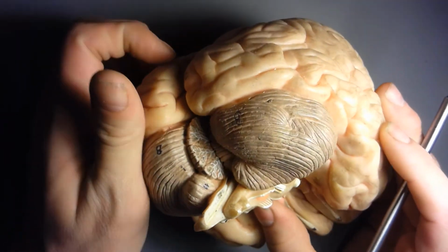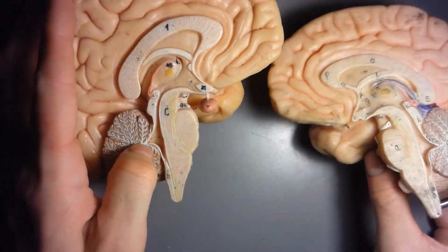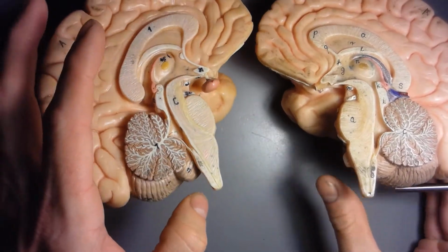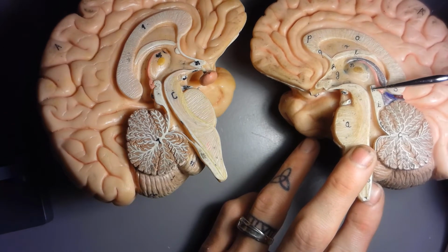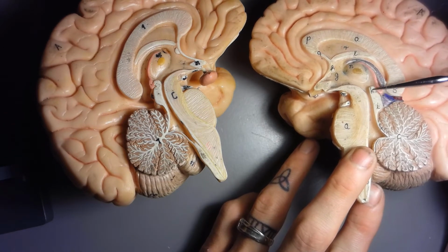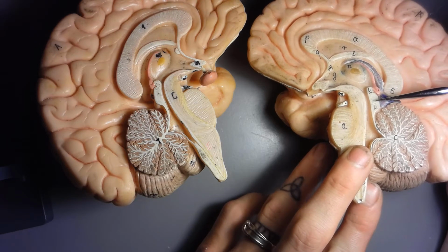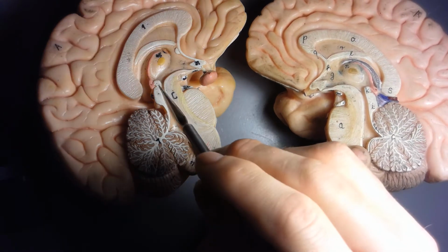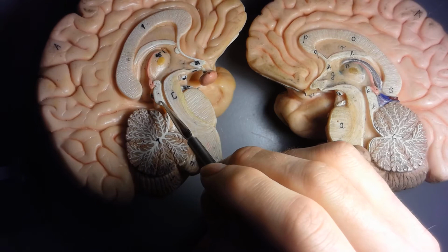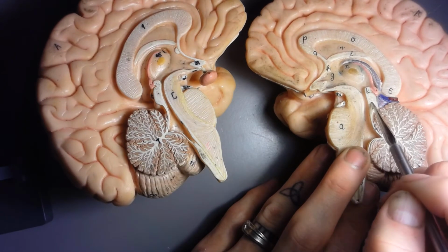Okay, next is the corpora quadrigemina. When I open this up here, you see these two little areas right here. These areas are called the corpora quadrigemina, which means four sets of twins, because there's 1, 2, 3, 4. So these together are the corpora quadrigemina.